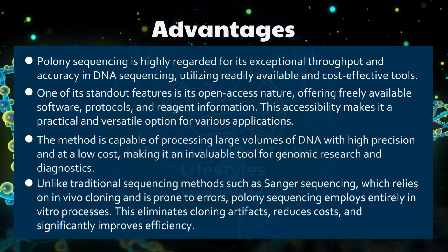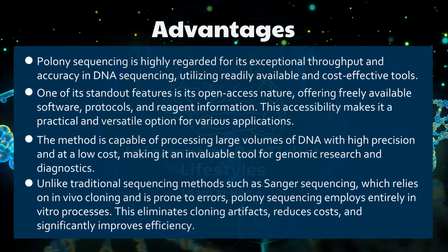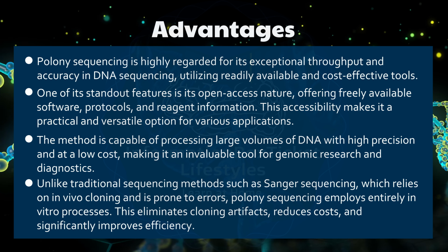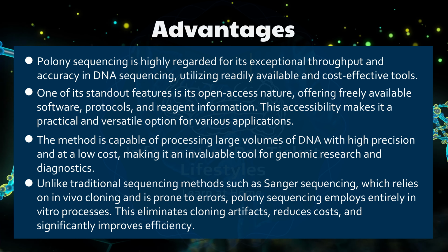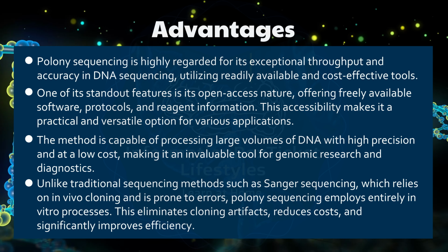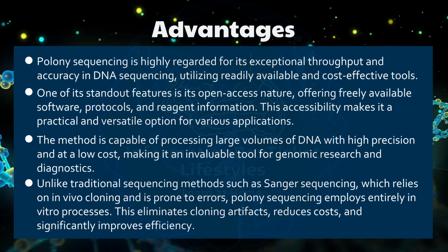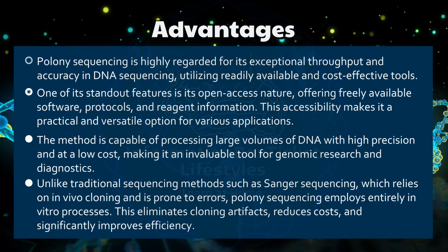Unlike traditional sequencing methods such as Sanger sequencing, which relies on in vivo cloning and is prone to errors, Polony sequencing employs entirely in vitro processes. This eliminates cloning artifacts, reduces costs, and significantly improves efficiency.